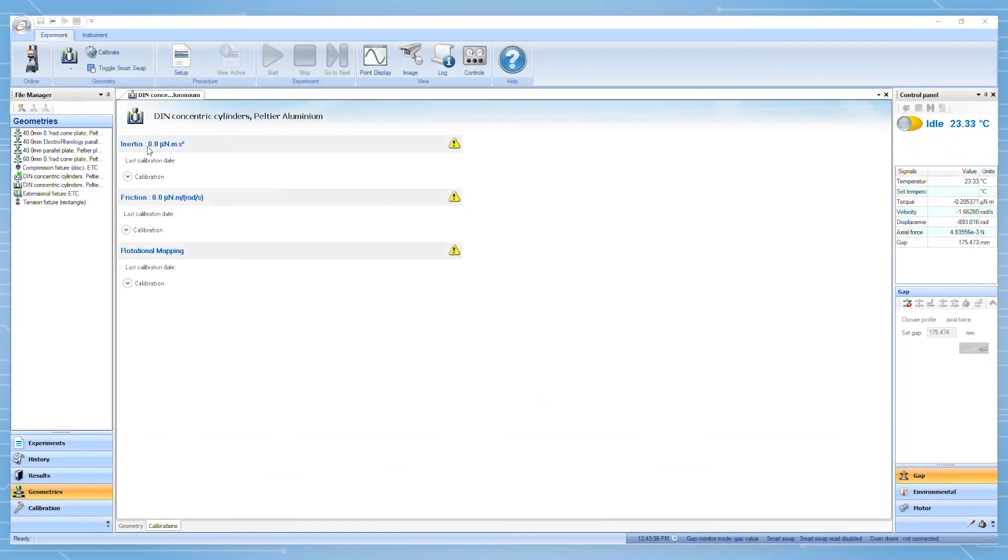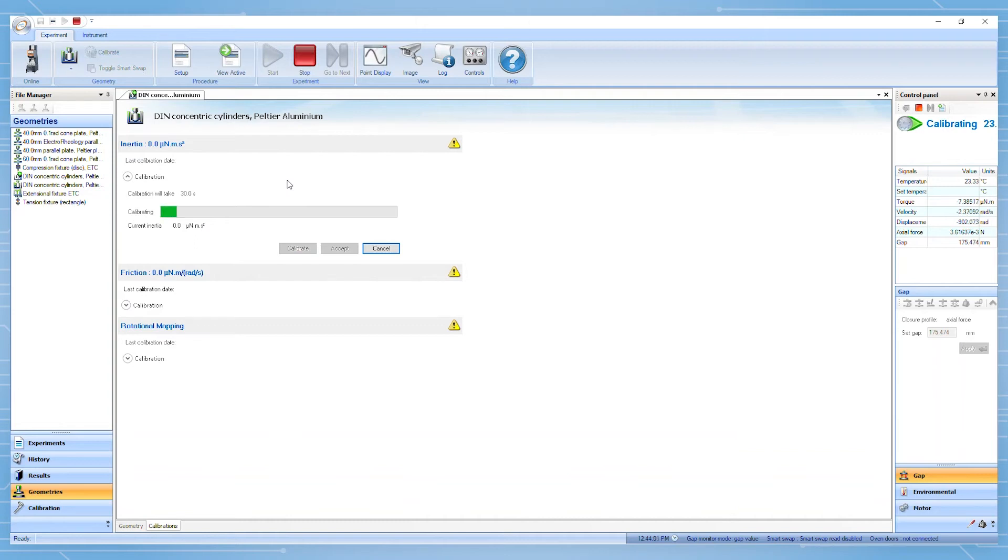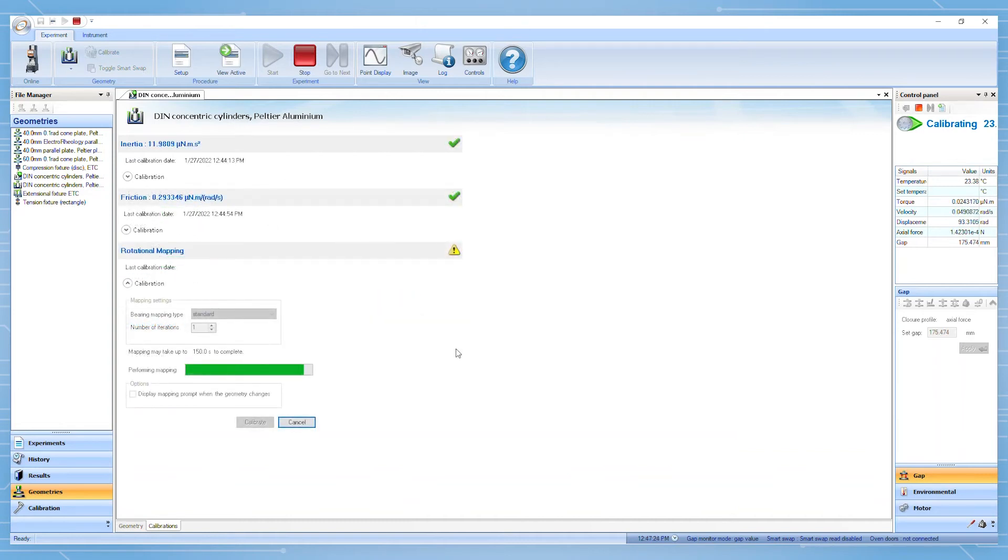Afterward, TRIOS will bring you to geometry calibration. The calibrations will include inertia, friction, and rotational mappings, all of which can be completed quickly with the on-screen prompts.